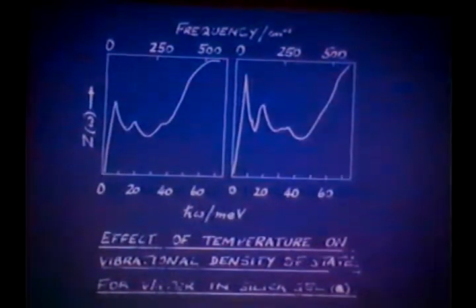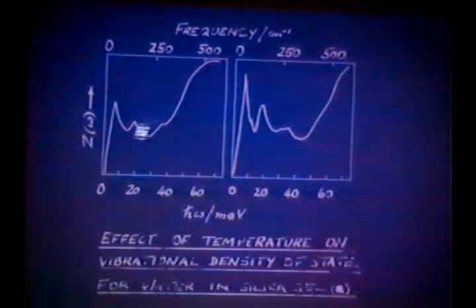What we think we see here is evidence for, here we've got liquid water, obviously. In this case here at 265, we see this peak coming up. And I think what we see here is evidence for a mixture of liquid water and ice. It would seem perhaps that the ice is forming further distance from the surface than the liquid water, which still remains close to the surface. And we've got this peak here, which shows us we've got liquid water still there.